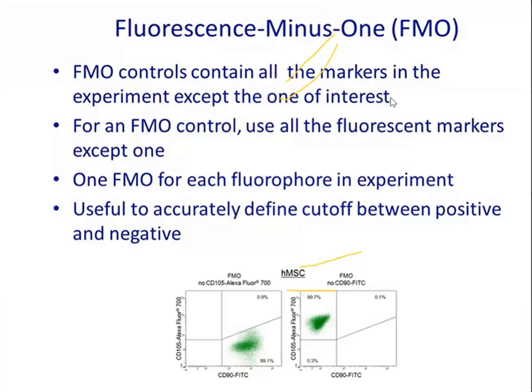Yeah, great. So this is a very important topic, and I want you to be clear with everything. You know what spectral overlap is, you know what spillover is now, and you know how this spillover is compensated, by using controls. There are single stain controls, where you use only one particular fluorochrome in one tube, run it in the flow cytometer and look for its signal in other channels.